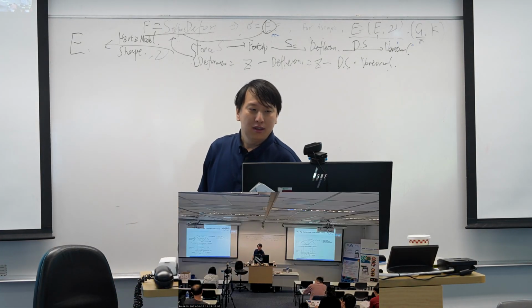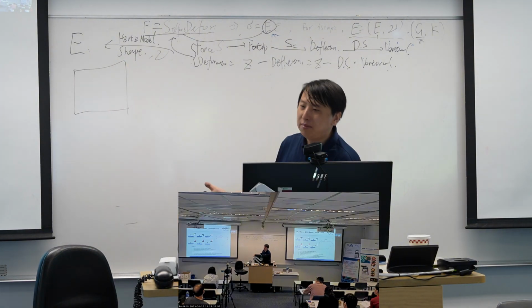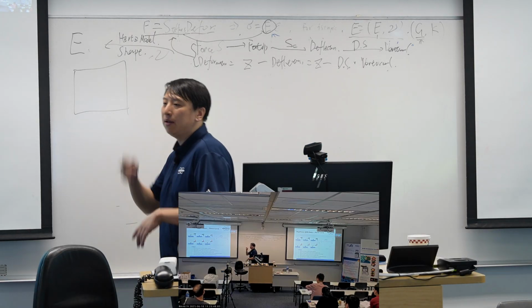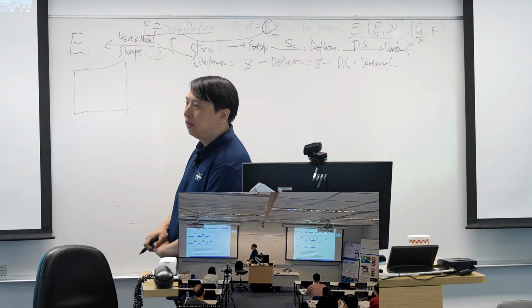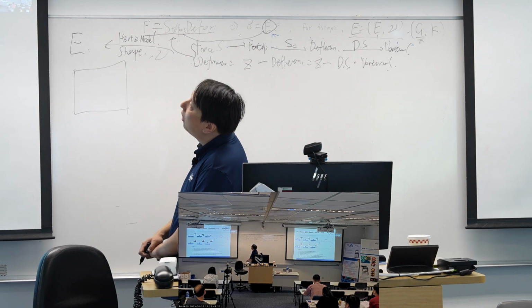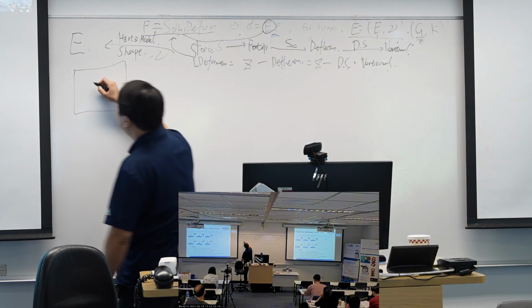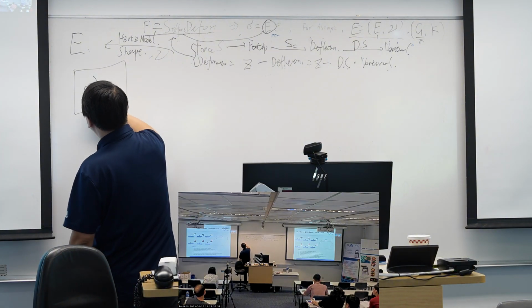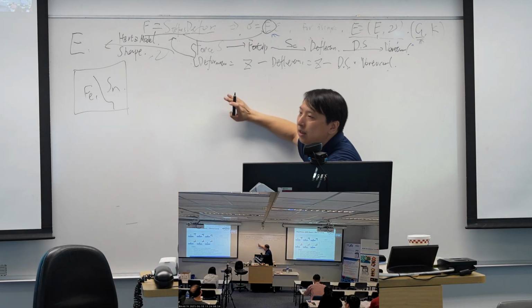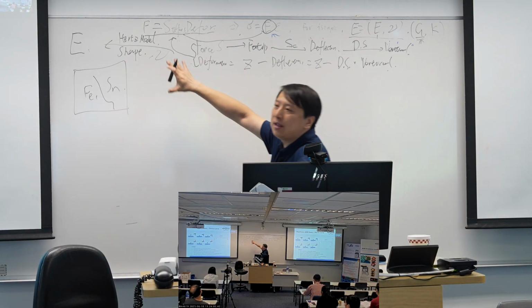But usually my sample is made up of several components. For example, we have an alloy sample, with some iron and some tin. My idea is to find out the distribution of the tin and iron on my sample.